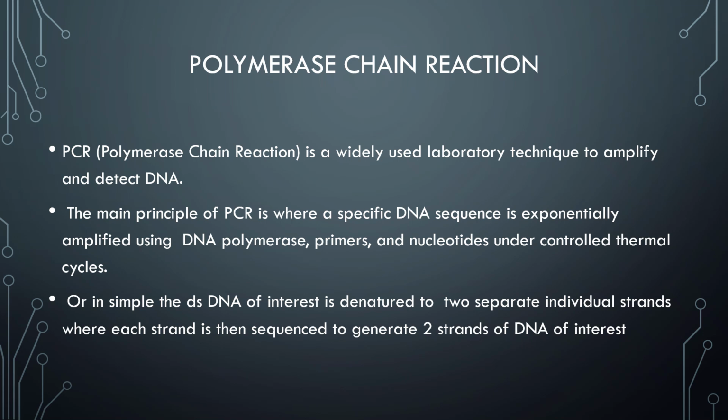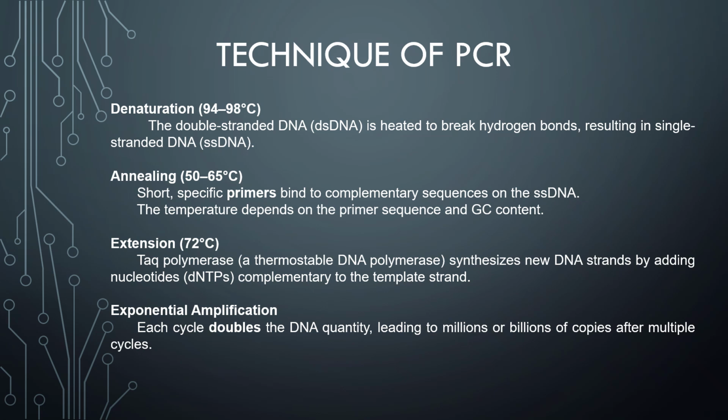Okay, let's continue more about PCR. I hope you find it interesting. So what is the technique? How do we do the PCR? For example, we got a small strand of DNA. Let's imagine this is the strand. First, what we do is split the strands, splitting the hydrogen bonds in between the strands. I'll show you the details. Give me a second.